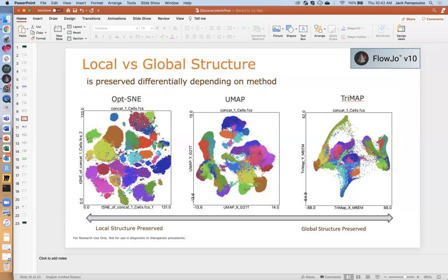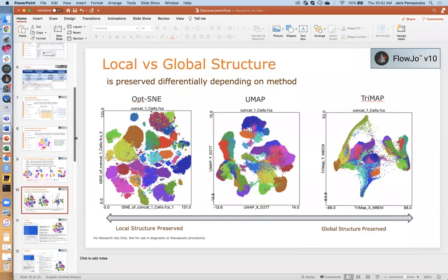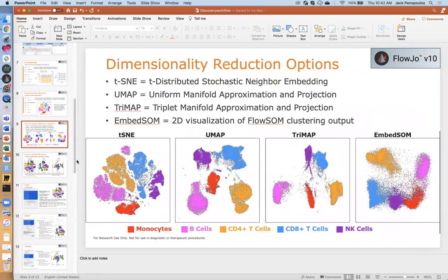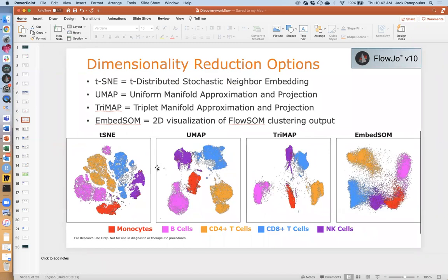Okay, let's take a look at this slide very quickly. Or maybe not that one. I want the one that has all four. This is a better explanation, or at least a better visual. All the dimension reduction techniques, what they do, again, is they project all of your data, all the different phenotypes of cells, onto a single two-dimensional plot, which makes it very easy to visualize all the data. It's right in front of you, all the different cells right in front of you. Cool.